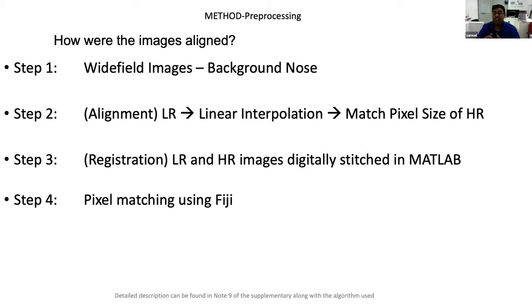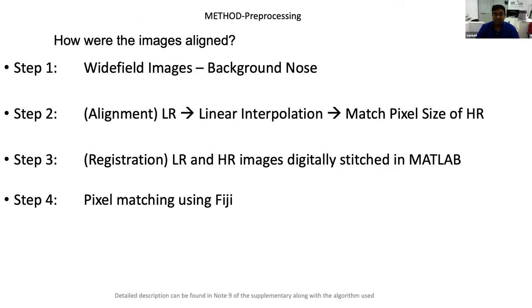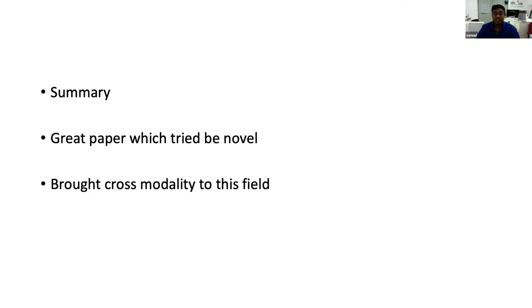And for how many images are you going to do this step? They did it for 2000 images, but if you had a data set of 10,000 images, could you use the same technique as well? So this is all about this paper. In summary, it's a great paper which tried to be novel by bringing cross-modality to this field. And that's about it. Any questions?